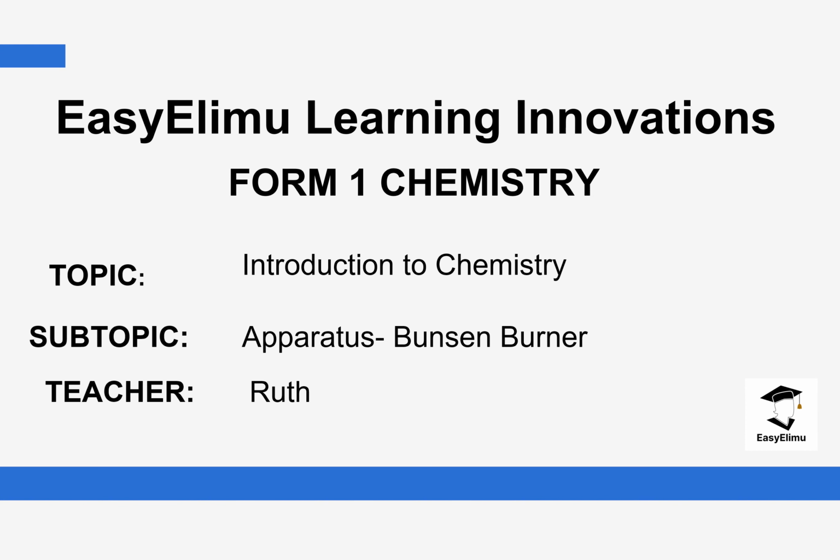My name is Ruth, and today we are going to be discussing the topic Introduction to Chemistry, and we are going to be looking at the Bunsen burner. Today we are going to be looking at the effects of heating water with both luminous and non-luminous flame, and we are going to make some conclusions.